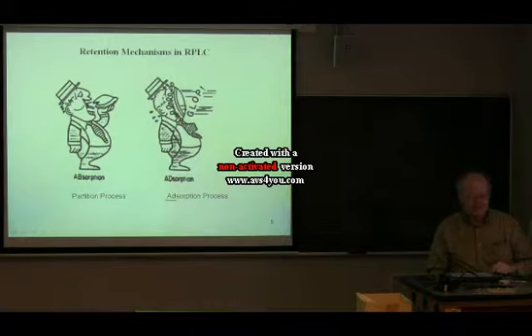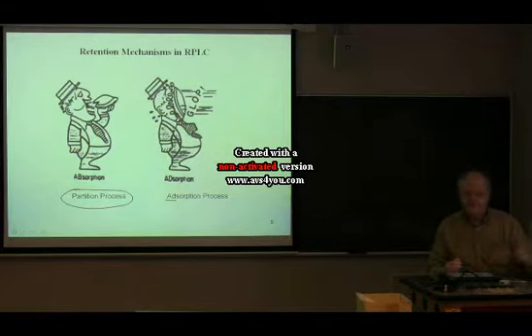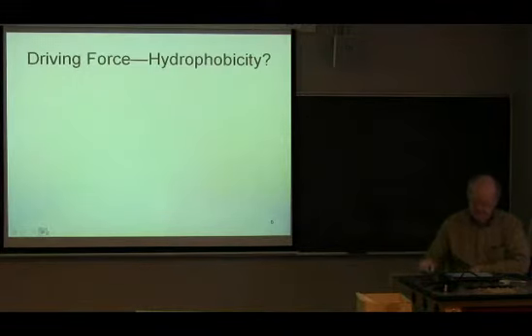And the conclusion of this talk will be that reverse phase chromatography, insofar as the non-polar parts of a molecule are concerned, is a partition process. This was a very hotly debated issue. Once people realized how valuable reverse phase liquid chromatography was, they wanted to figure out how it worked. And there were many, many, many studies. So back to the driving force, the hydrophobicity?